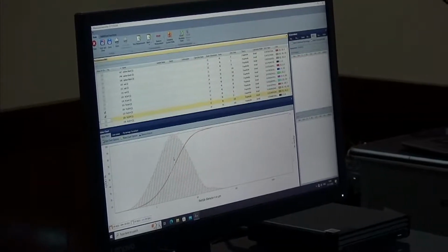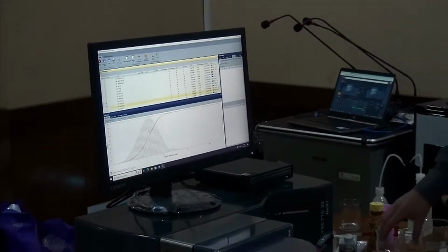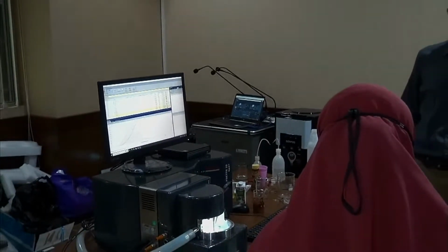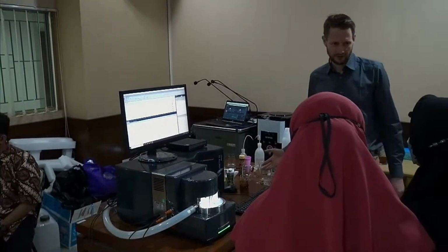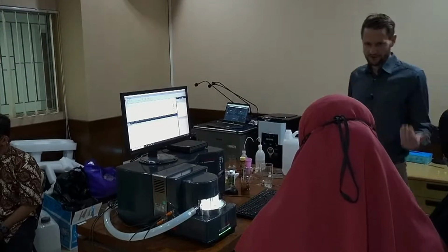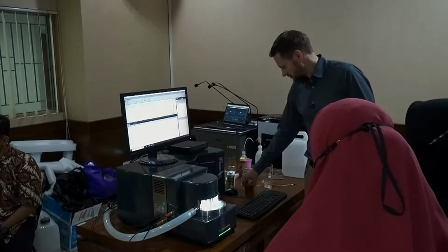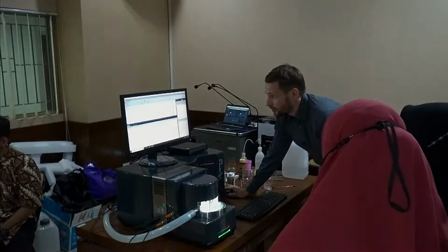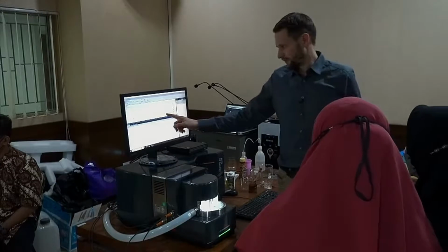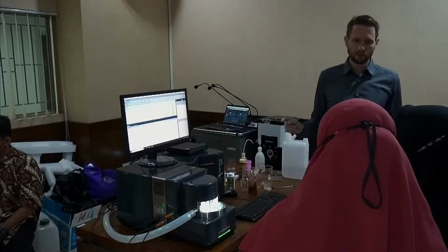Of course, we did all this with Fraunhofer. So another step, which we really want to work with this, is some research. Find the refractive index and the absorption coefficient for this material. If you can't find it, use the Mie search, run some iterations, look what fits, decide for some values, use them. They will probably, I can just give you an idea. So the nice thing also in the software is, let's say, okay, we used Fraunhofer. Now I'm telling you from the size range we're in, Mie would be more appropriate.